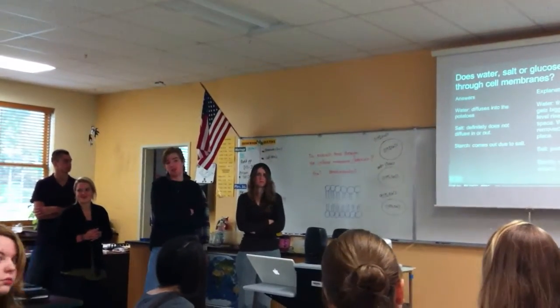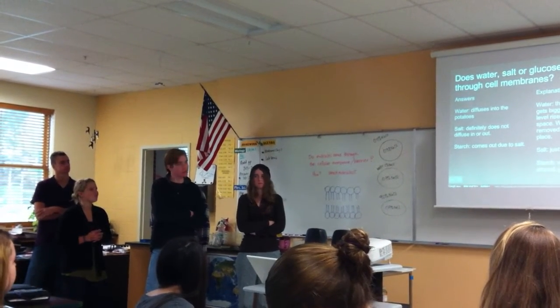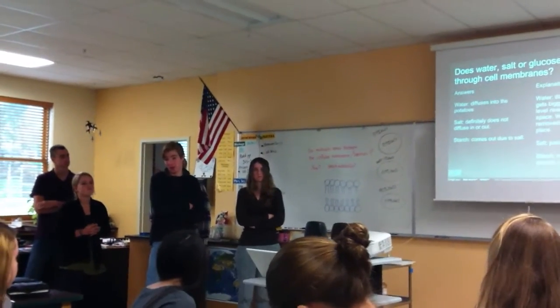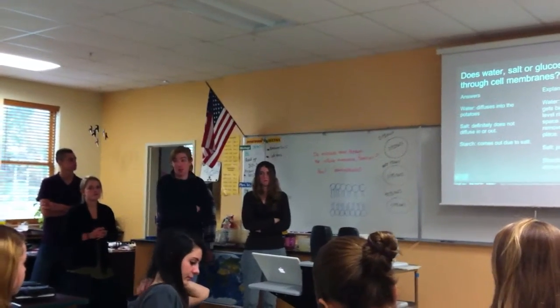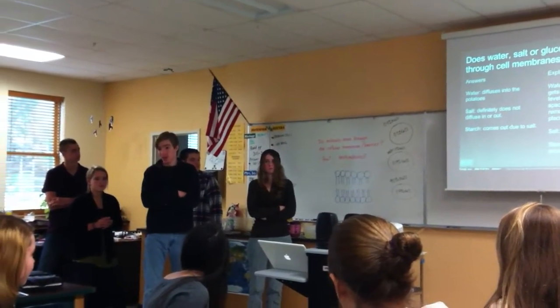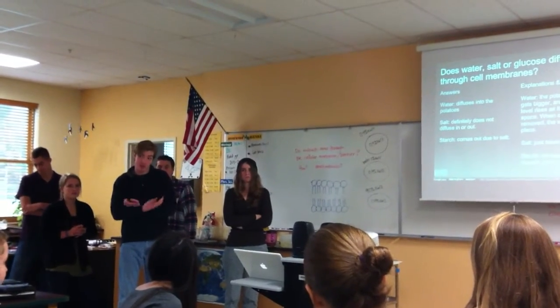And salt doesn't diffuse, we think, because there's no evidence of that at all. But the starch definitely does. The starch definitely comes out due to the salt water. How that works, I'm not sure, but it makes sense, seeing as with the high concentration of salt, the starch left, so it must be due to the salt, right?